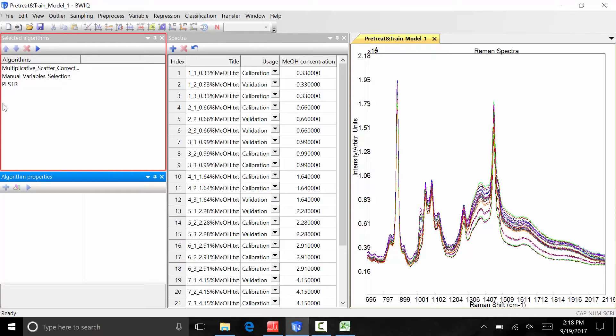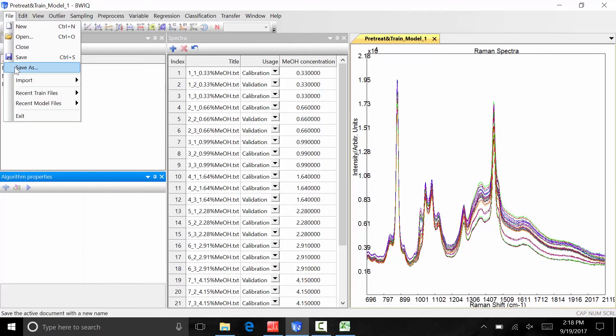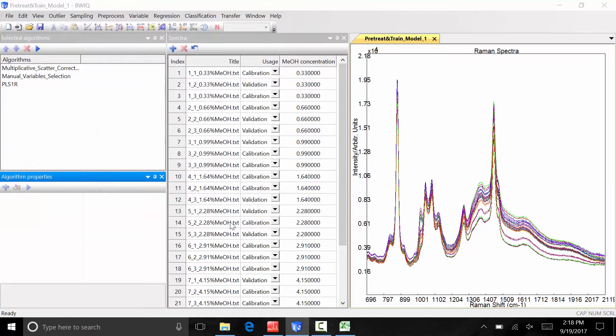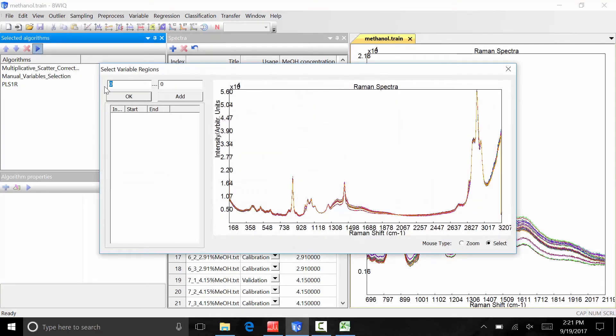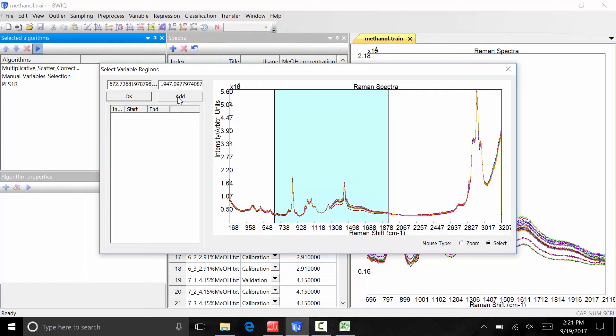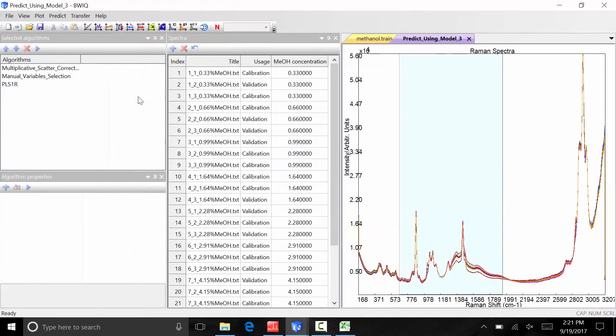To save this training file with the extension dot train, go to file, save as, and save the file. Training files can be saved at any time in the method development. To execute the method, click the blue triangle at the top of the selected algorithms window. A variable selection window will appear, allowing us to isolate the spectral region of interest. This can be done manually or by clicking and dragging the mouse over a region of the spectrum. Once the spectral region is selected, a separate window will open with all the pre-processing algorithms applied to the spectra in the data set. This is the model window. This model file with the extension dot cmml can also be saved by going to file and save as.